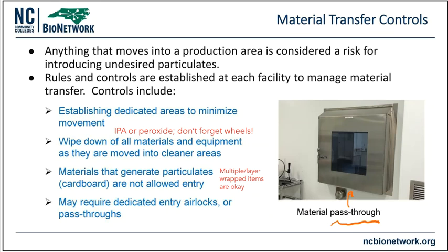And then on the other side, they have another door, so they can open their side up and ensure that, sure enough, these things are completely clean, they've just been sterilized, they've just been treated, and they have gone through this process of cleanliness, so that I can use them on my side if I'm working in a cleaner area. So rules and controls are established to put things like pass-throughs in these facilities in order to manage these materials a little bit better and streamline it a little bit better to reduce, again, the idea of cross-contamination that can happen on a bigger scale.